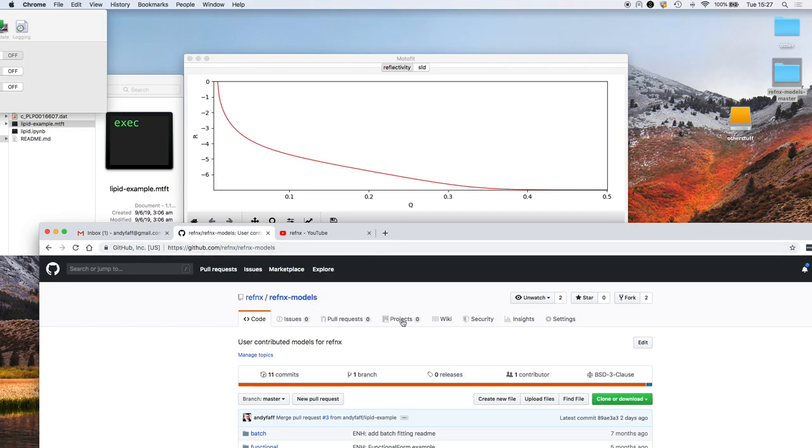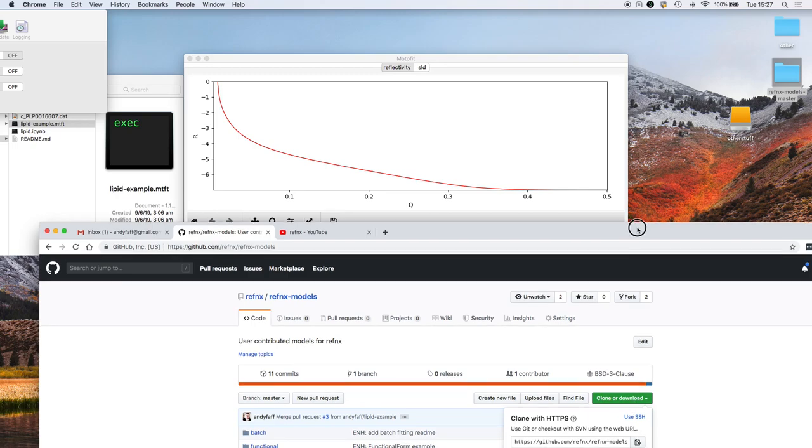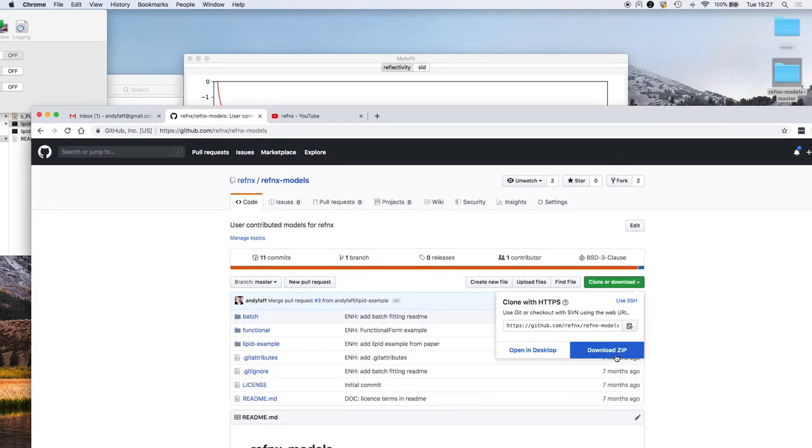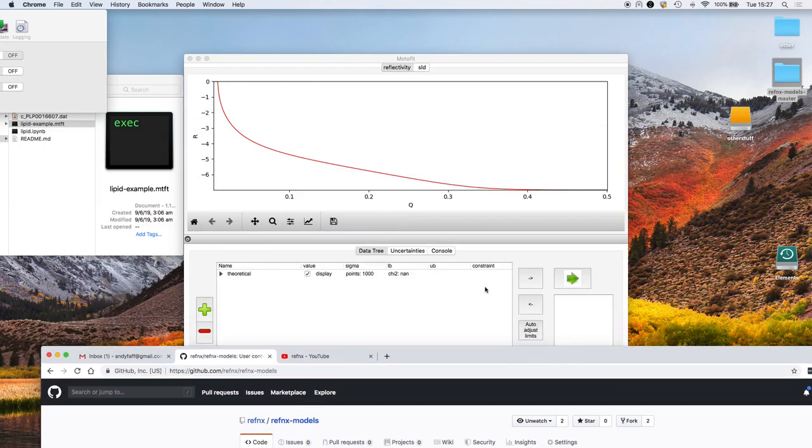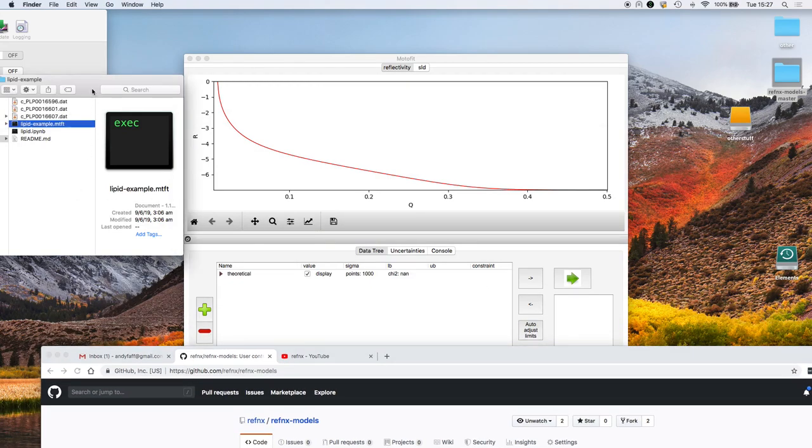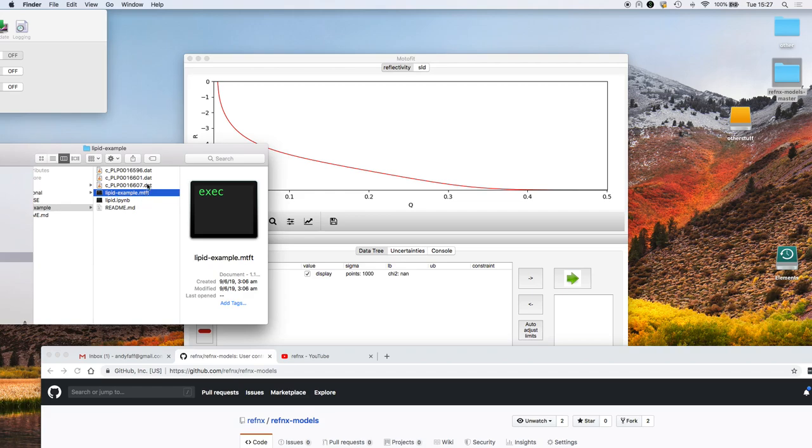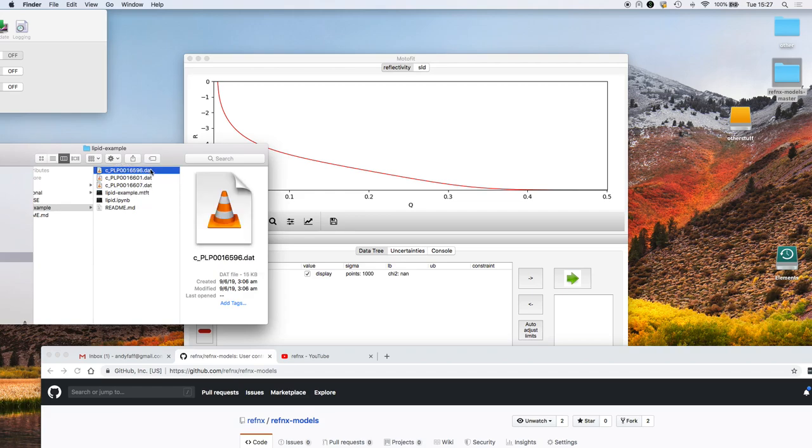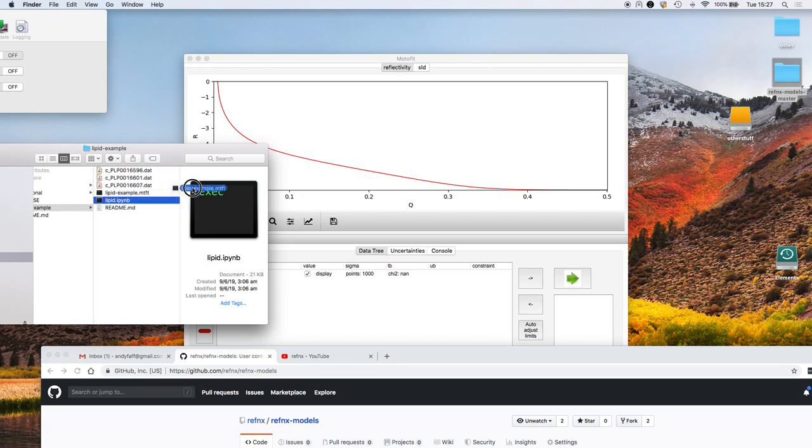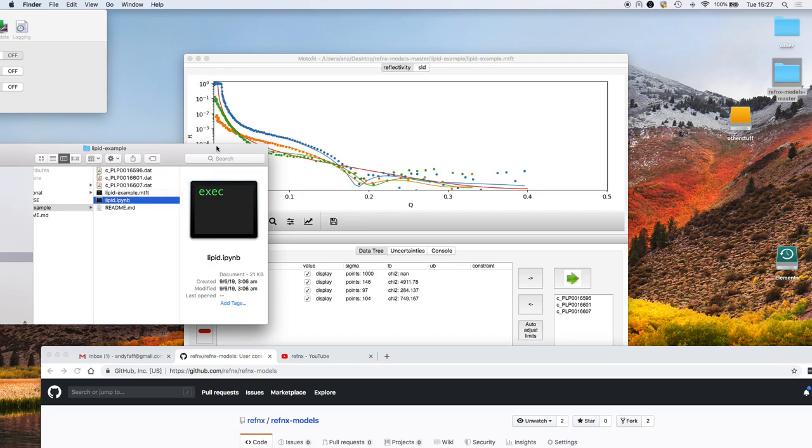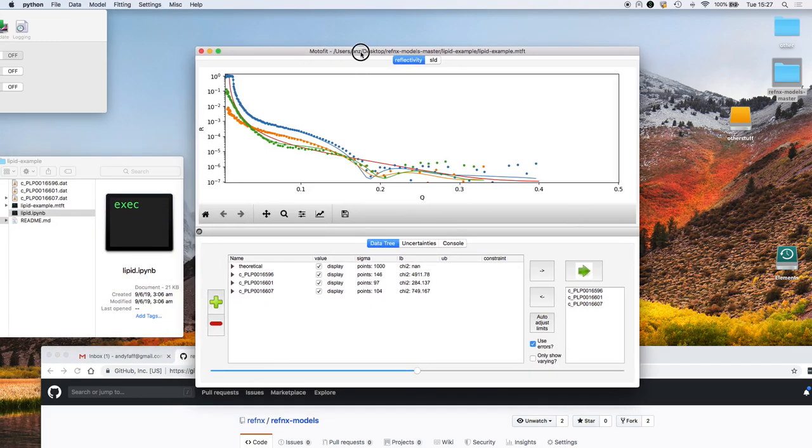Once you find this particular link, go to the clone or download button and it will allow you to download a zip. I've already done that and in that zip file are contained the three different data sets, the Jupiter notebook so you can do the reproducible analysis yourself, but what I want is this motofit file and that's output from the Refnex GUI.